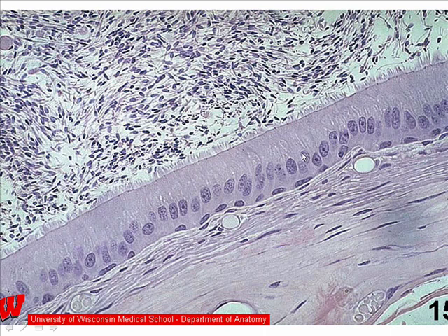By comparison, the next slide shows a pseudostratified epithelium. How do we know that this is pseudostratified? Well, one of the first things that you should note is that there are two consistent layers of nuclei. There are the ones that are fairly oval in shape and are sort of in the middle of the cell or a little bit basal in the cytoplasm. And then there's another row of nuclei which are somewhat flattened along the bottom.